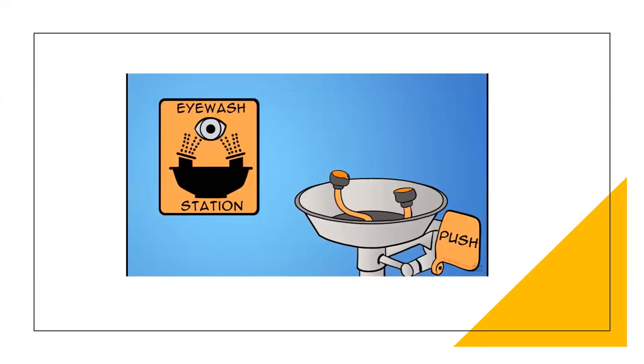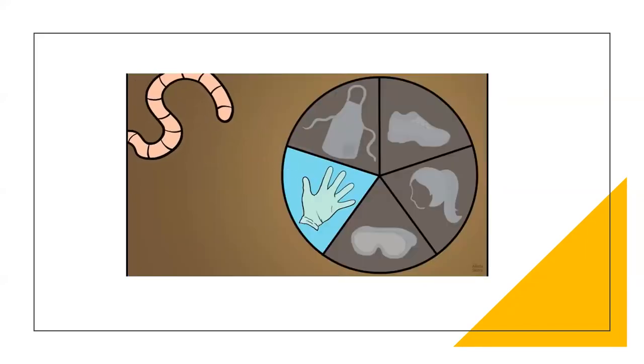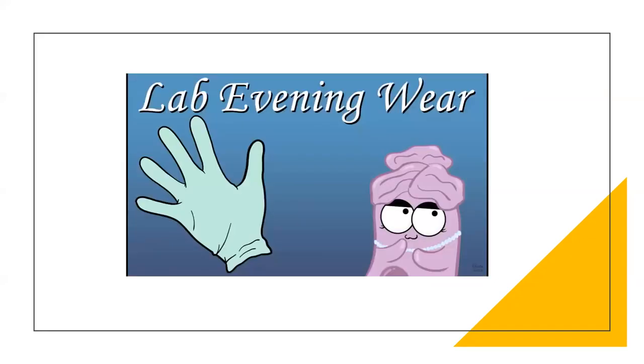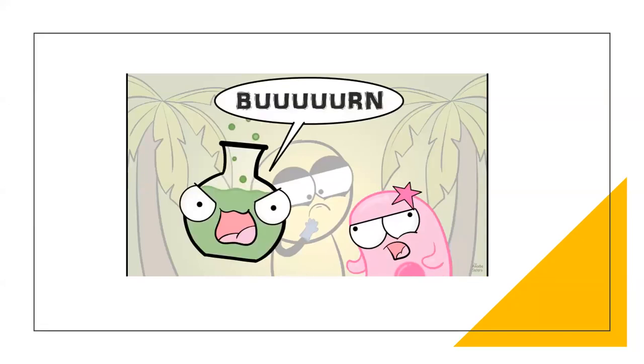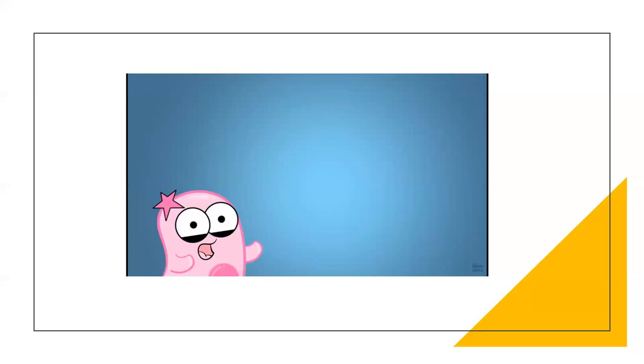If you do feel as though something has gotten in your eyes, you will want to use the eyewash station, which will require you to hold your eyes open under the running water. If your lab involves working with specimens or chemicals, you will likely be advised to wear gloves. Gloves are important. Yes, sometimes they make your hands feel clammy, but you know what's worse? Chemicals that can irritate or burn your skin. If you have an allergy to latex, you should make sure that the gloves you are using are latex-free. Ask your instructor. In fact, if you have any allergies, you should let your instructor know.